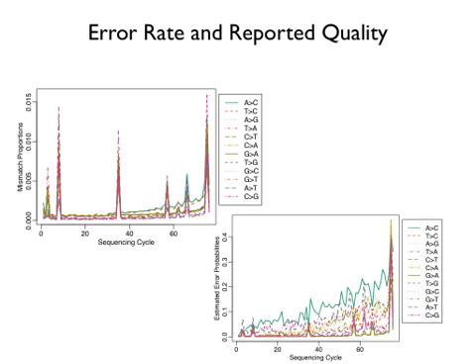Once you do that, then you assume that every mismatch to the genome is an error, right? So here what I'm plotting is the proportion of mismatches, and then of each kind. There are 12 different kinds of errors you can make. A turns into C, T turns into C, A turns into G, T turns into A. Every possible error is shown. And in this picture, we already see that A turning to C and T turning to C are more common than the other errors. So that's the systematic error I was talking about.